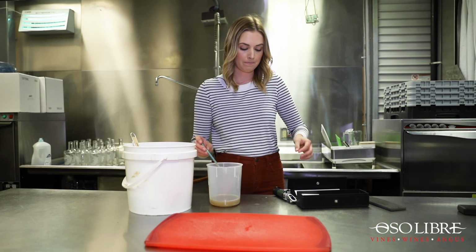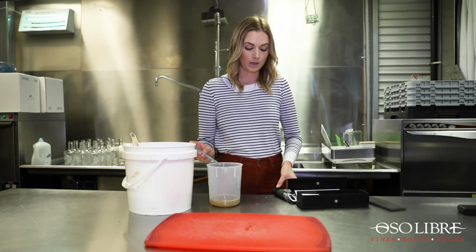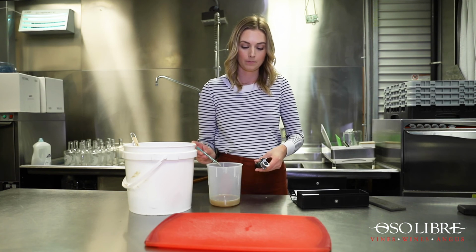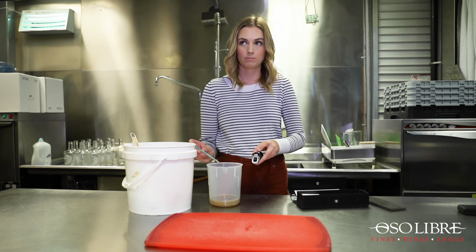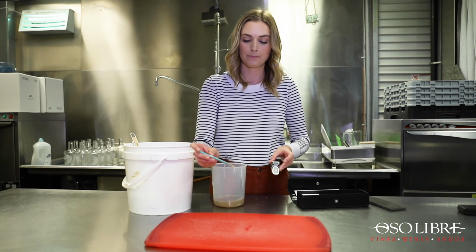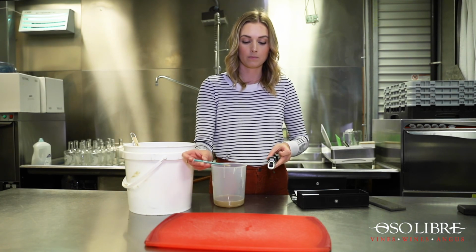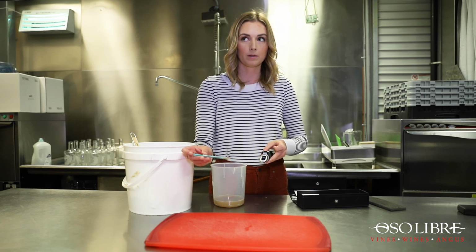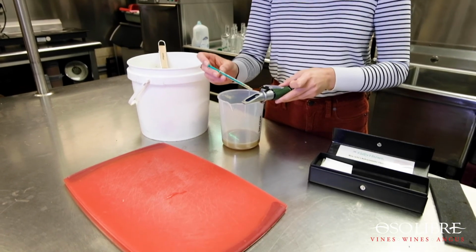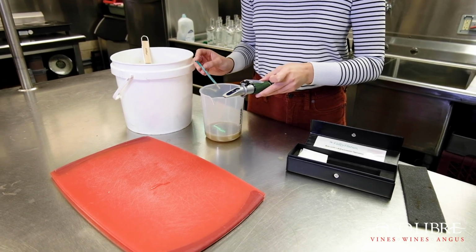There you go. And then what I want you to do, the way that you're seeing the prism is correct. With the dropper, maybe if you want to experiment on the board there, try to put one drop down. Now, on the angled prism, the one that's furthest away from you, put a drop on there. Like in the middle? In the middle. One drop. Now you can set down the dropper.